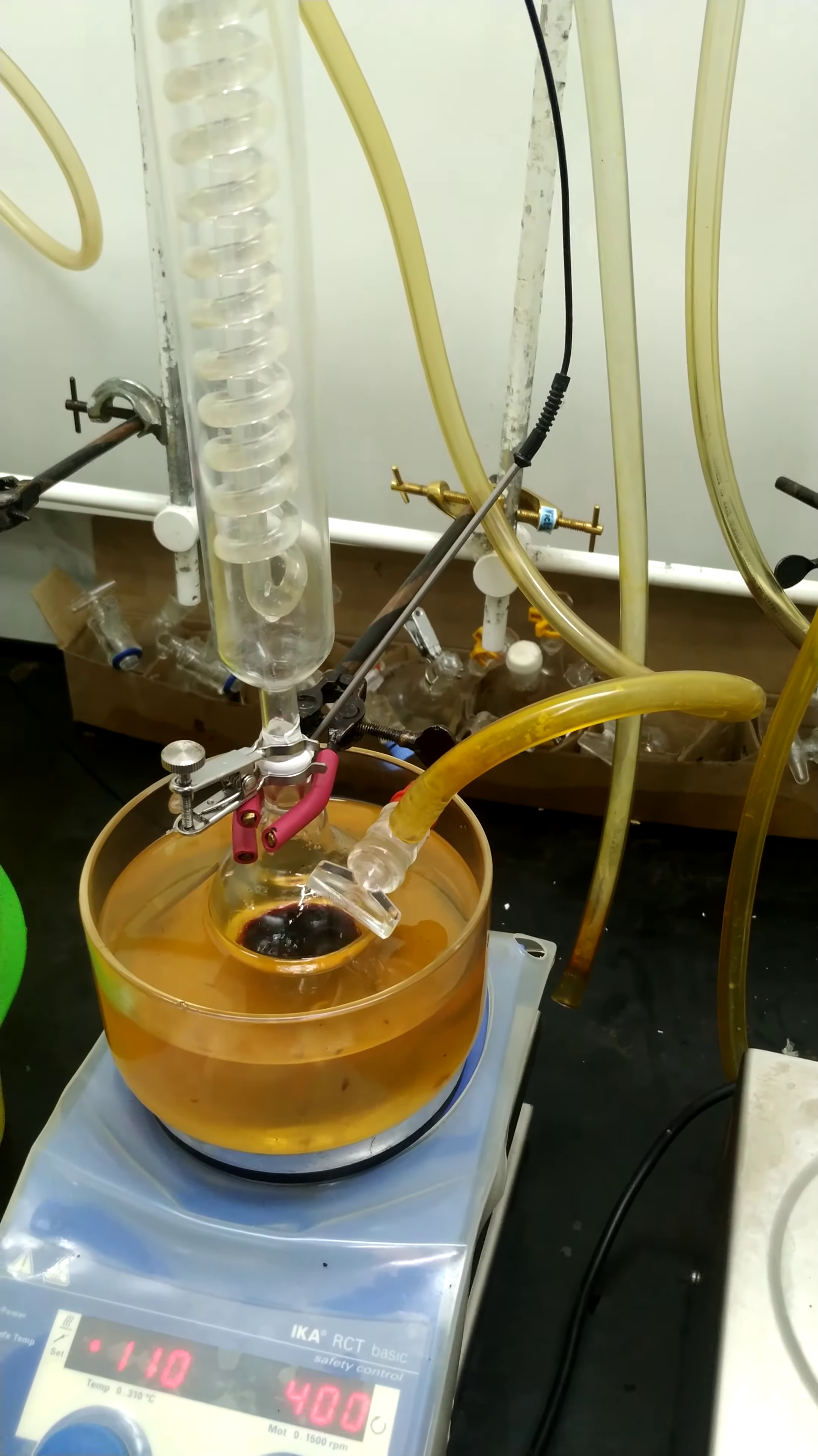Why do we do this? Because sometimes there are undesired volatile byproducts in the reaction. We can remove those volatile components by reflux. When we reflux, we can apply vacuum using the schlenk line in between.